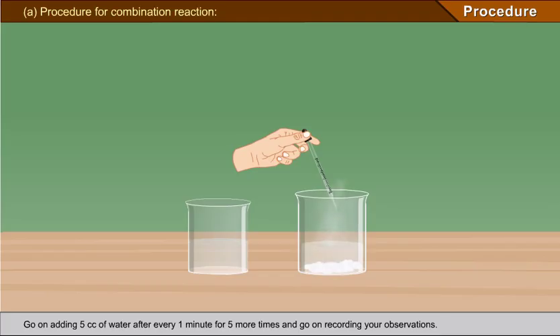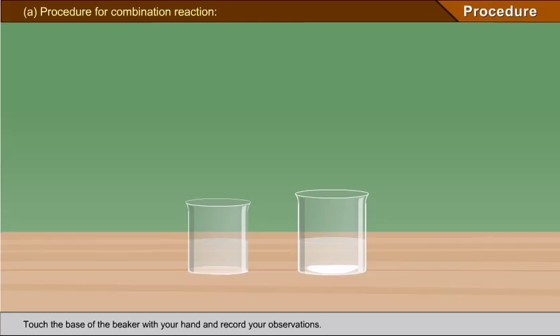Observations: As soon as the water comes in contact with the quicklime, it starts crumbling, producing a sound of crackling noise. It gives off steamy vapor.